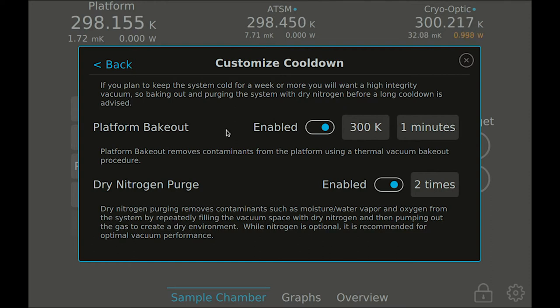These steps are especially helpful if you've had the sample chamber open for an extended period or if you plan to keep the system cold for a long period of time. The platform bakeout uses a thermal vacuum bakeout procedure that applies heat to the cryopumping surfaces while running the vacuum pump to help desorb and pump out contaminants such as water vapor. After enabling, you can adjust the bakeout temperature and duration as desired. Just be careful if you are using materials such as grease to mount your sample, as the bakeout can cause grease to run into places that you don't want it.